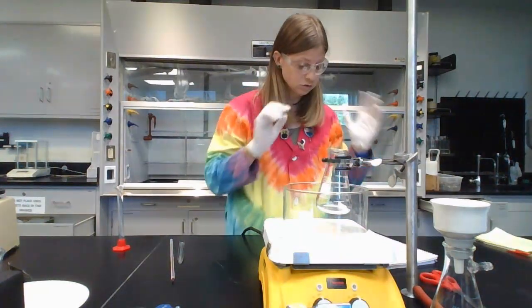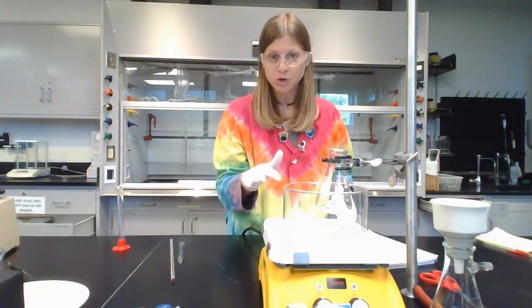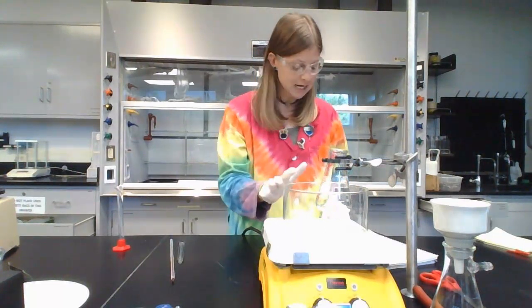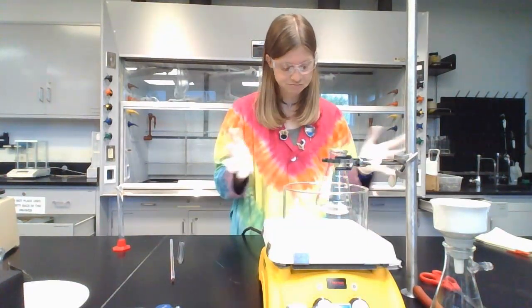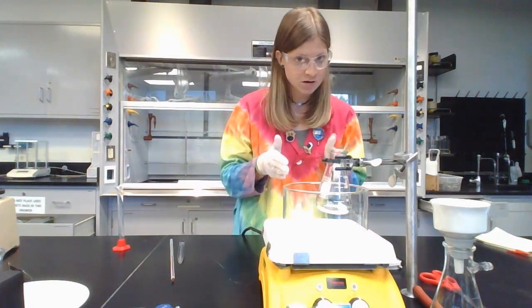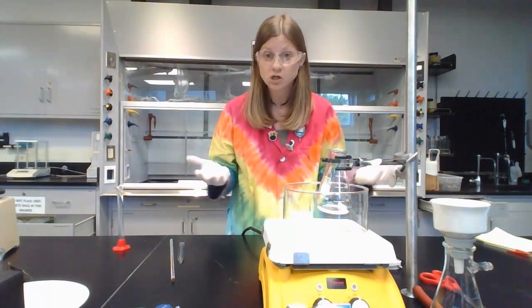So that is going to need to mix, stir, and heat for about 20 minutes. So you need to periodically check on the water bath to make sure it's still in the 80 to 90 degrees Celsius range. But you're going to let that stir and mix, just checking on it. While that happens, you're not going to sit here and stare at it. You got to move on and start working on other things so that way you can eventually finish this lab.